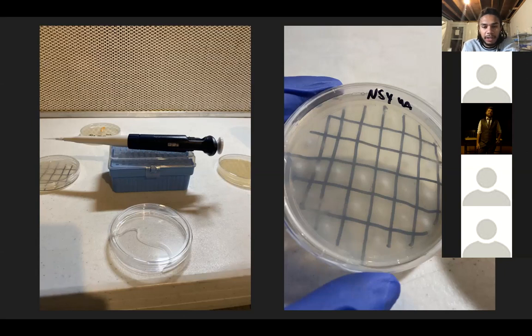If you look in there and there's like 50 spores, then you're going to need to dilute that again. So I'll take like 10 microliters of sterile water, squirt it into that dried up spot with like 50 spores, and then take it out and drip a little bit into another petri dish with a different grid. And then you're just going to keep doing that until you look in the microscope and there's just one spore. This takes so long and it's so annoying. But some people prefer serial dilutions.